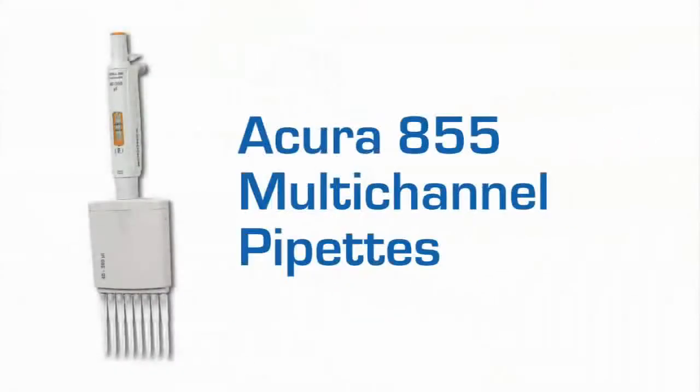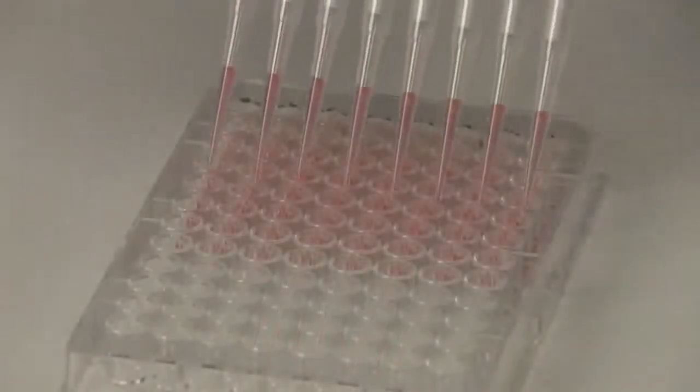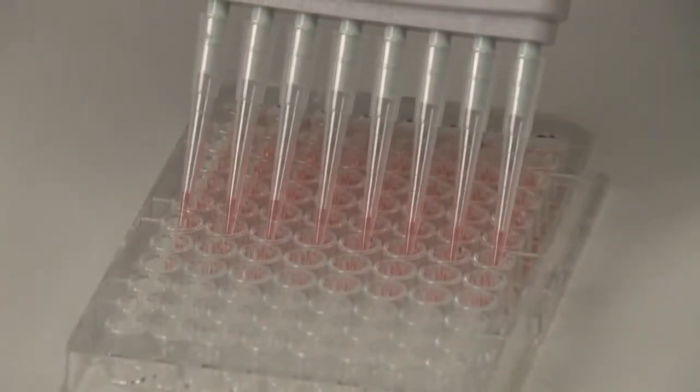The Acura Manual 855 multi-channel models come in both 8 and 12-channel models to enable high-throughput pipetting with microplates.